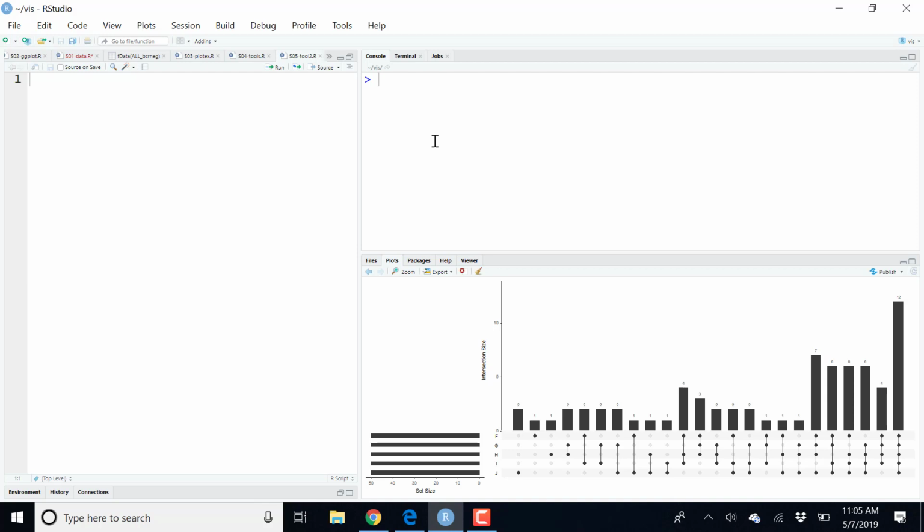The way hierarchical clustering works, the first step is always to calculate a distance between all these samples. So here we have 5 samples, so that would give us a 5 by 5 matrix with all these distances. And then the first step is to group the 2 samples that are closest to each other based on that distance that we use.